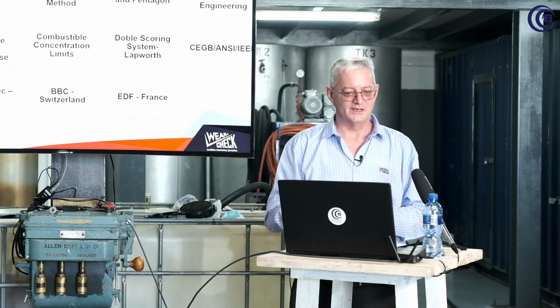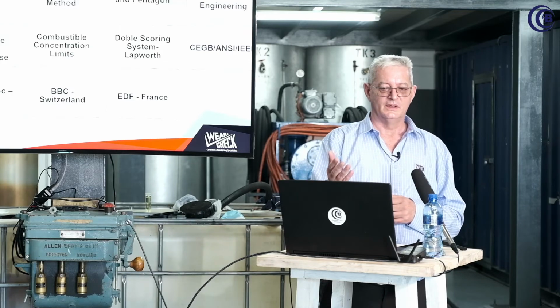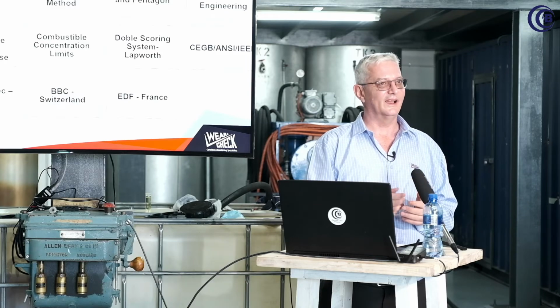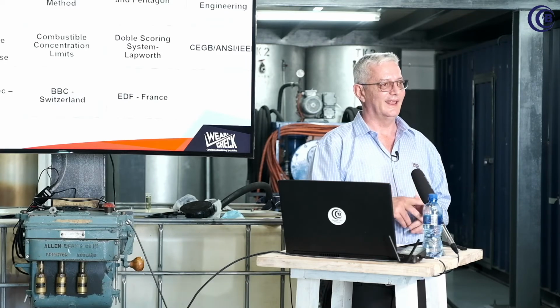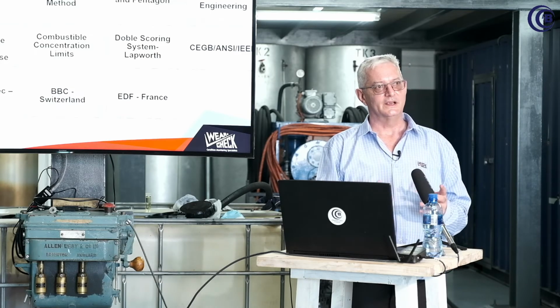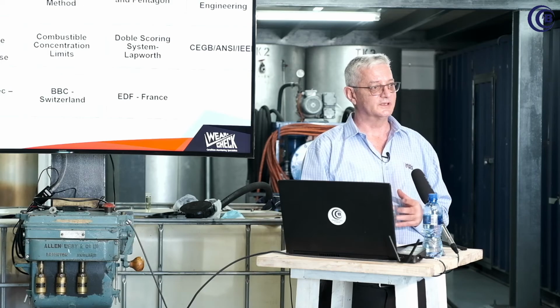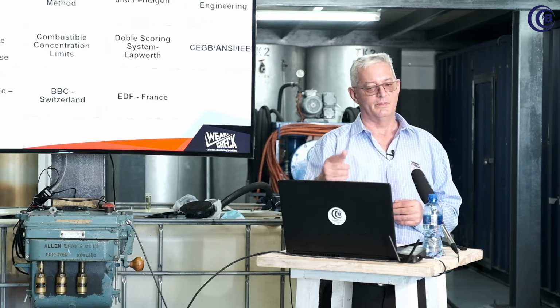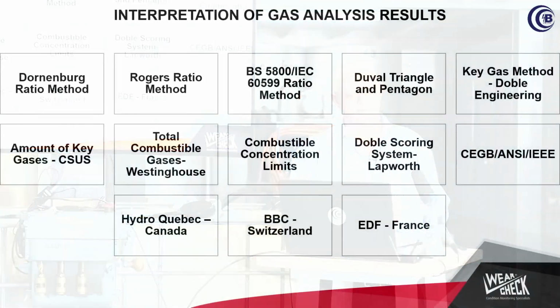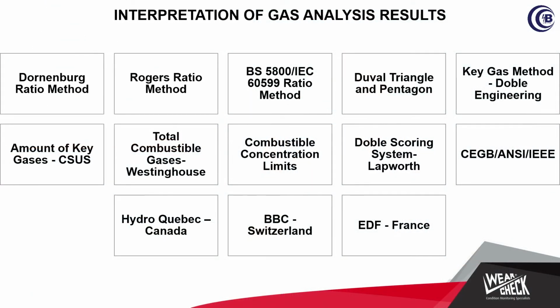In South Africa, we use the Doernenburg, Rogers ratio, the IEC 60599, Duval triangle, and pentagon. Now, that is mainly what is used nowadays. All the other methods are older. The newer diagnostic methods nowadays are the Duval triangle and pentagon, both of which are now in the Wearcheck software. We look at key gas, CIGRE guidelines, Westinghouse, and then the combustible concentration limits.